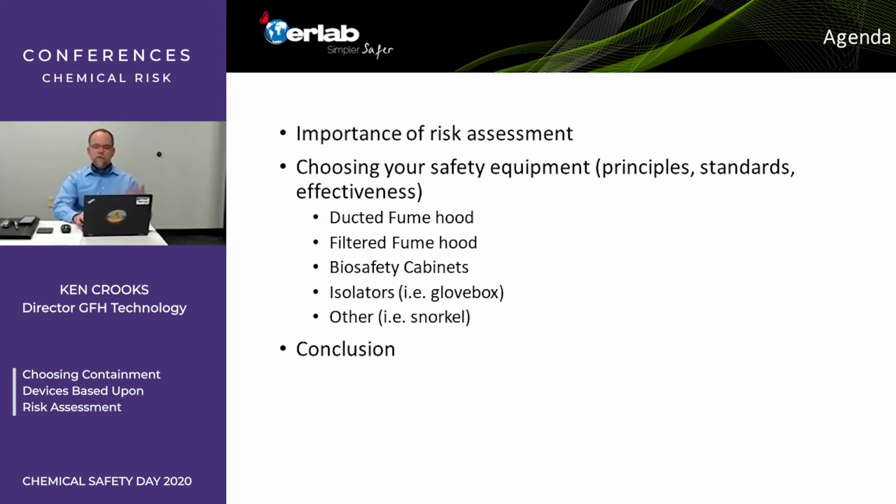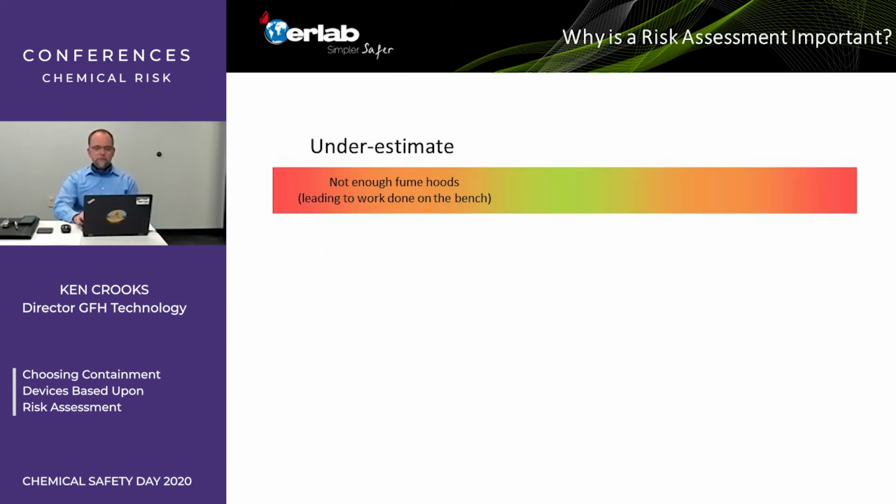I will focus mostly on fume hoods, chemical fume hoods. That's what the majority of this is about. We could spend more than an entire day talking about containment devices, and I would not be the expert for that. Fume hoods is my life, that's my background, but we will touch on biosafety cabinets, isolators, or glove boxes, as we like to call them, and then very briefly other types of solutions, and then lastly we'll conclude.